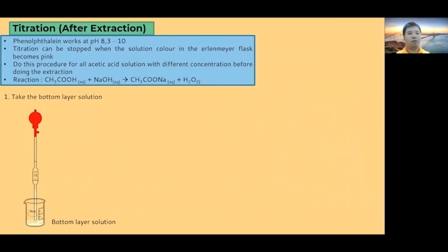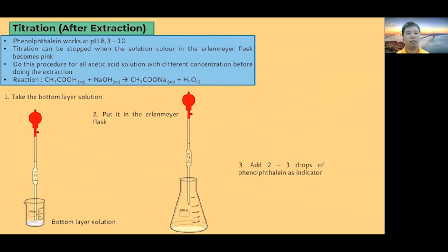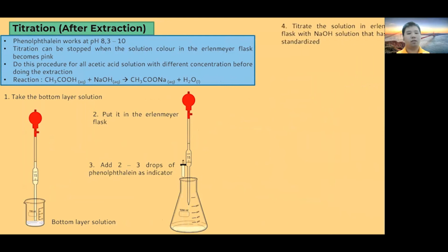In this step, we do the titration to get the concentration of the bottom layer solution. The procedure is the same as the standardization titration, but here the bottom layer's solution is used.